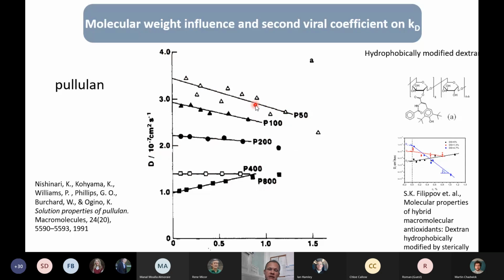And again, some people might be confused by that. The software provides the user with the value of hydrodynamic radius, and they measure a series of concentrations and see that the hydrodynamic radius is changing, and they say, "Oh, look, my particles are getting bigger or smaller, so I have some kind of new phenomenon." But this is not true. What they actually observed is just the concentration dependence of the diffusion coefficient, and it's not related to the size of the nanoparticles.